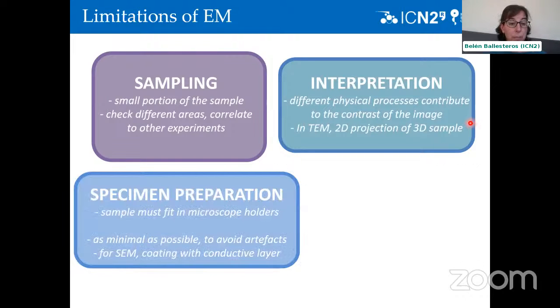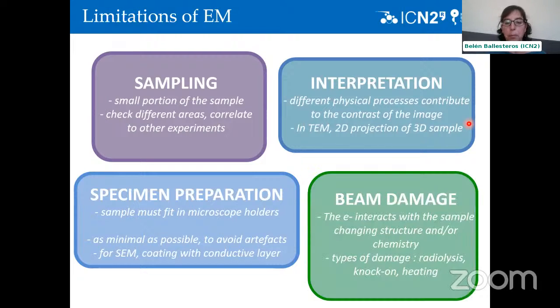With regards to specimen preparation, the sample must fit in the microscope holders, and this is especially important for TEM. And also, we should try to make the preparation as minimal as possible to avoid any artifacts on the sample. And for SEM, we have to take into account that depending on the SEM we're using, we will need to coat our samples if they are insulating.